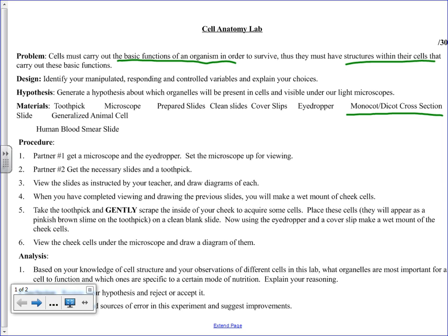It just appears dark enough because it's covered in ribosomes, so it's dark enough that it shows up. You're not going to see specific dots at all. In fact, it'll be hard to recognize as rough ER, except that we've said it often looks like the goatee on the nucleus. So that's one of the things you'll be looking at, the plant cell.